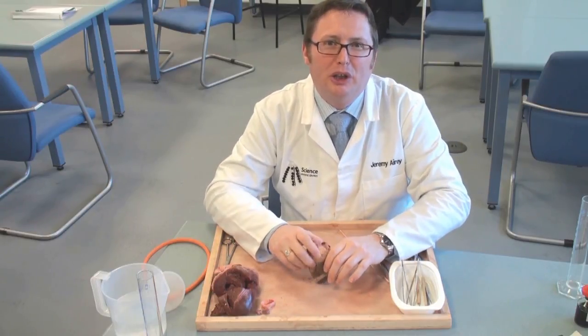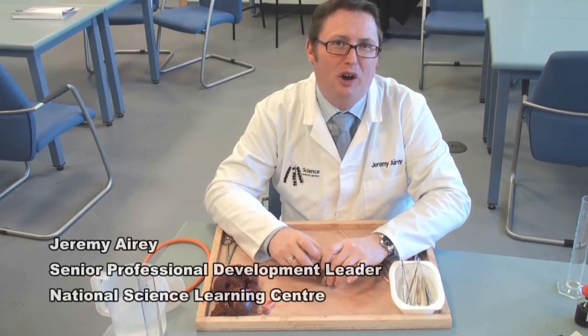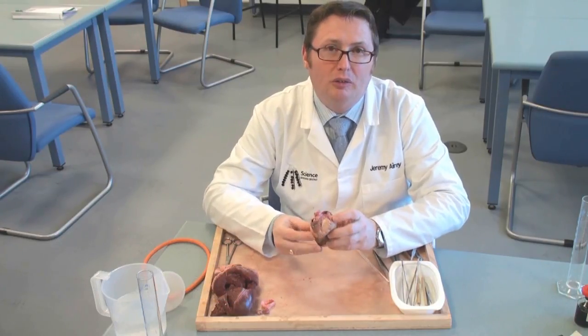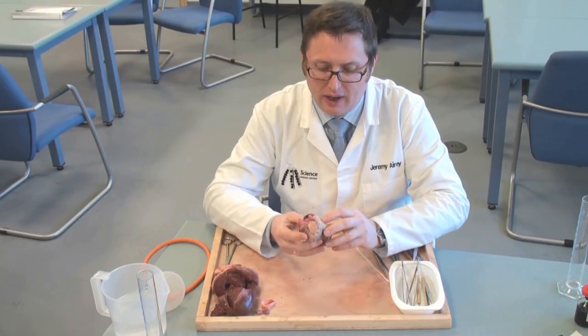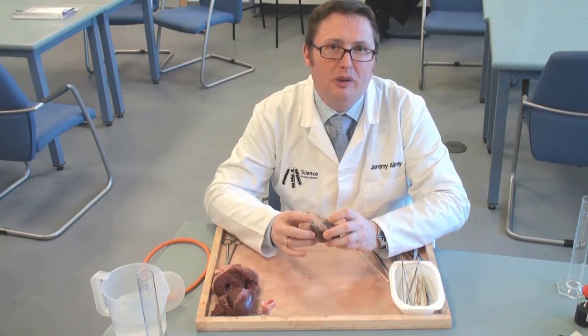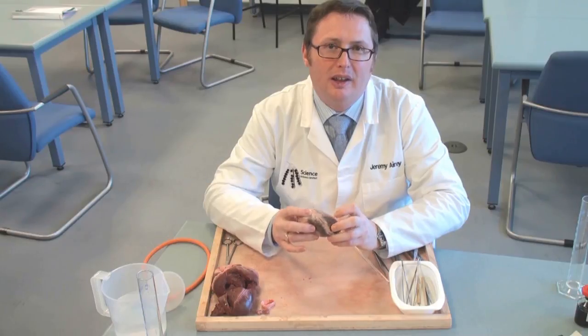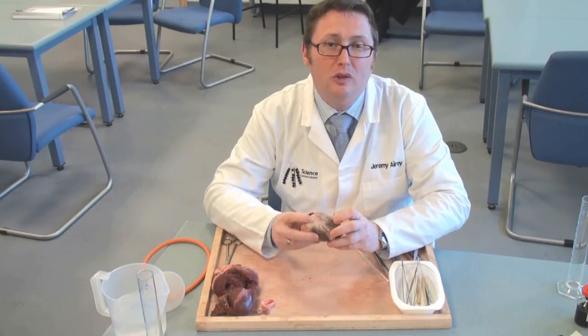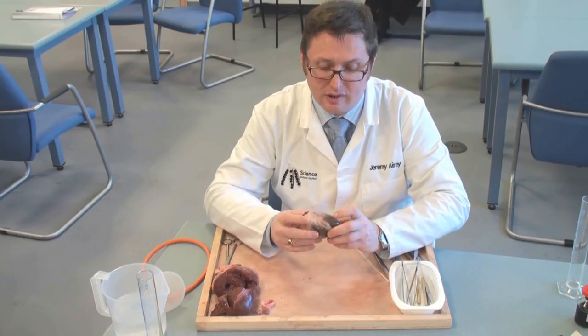I'm going to spend a bit of time showing you how to get the best out of a heart dissection. I've got a heart here that we got from our local abattoir, and we've managed to develop quite a good relationship with them so that they know they need to try not to slash the hearts about too much so that we can use them properly when we're doing dissections.